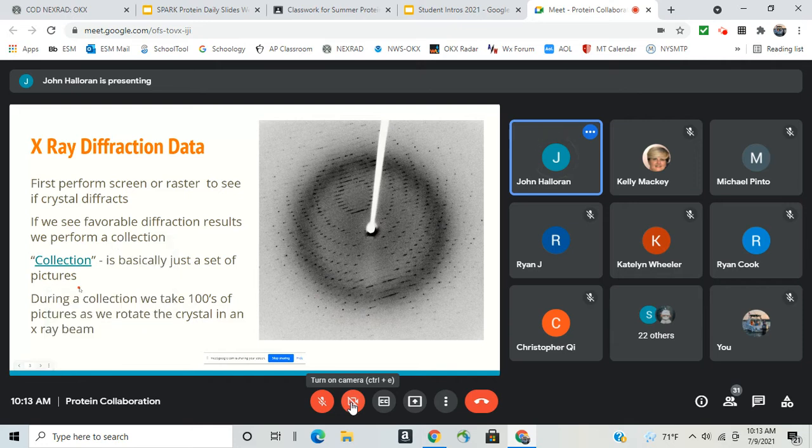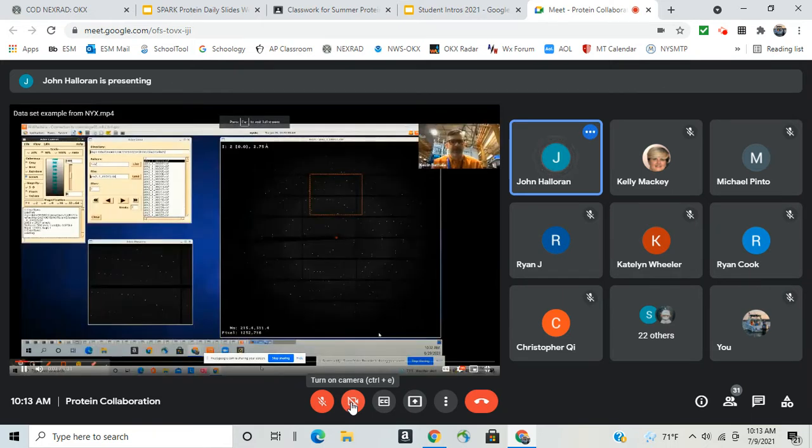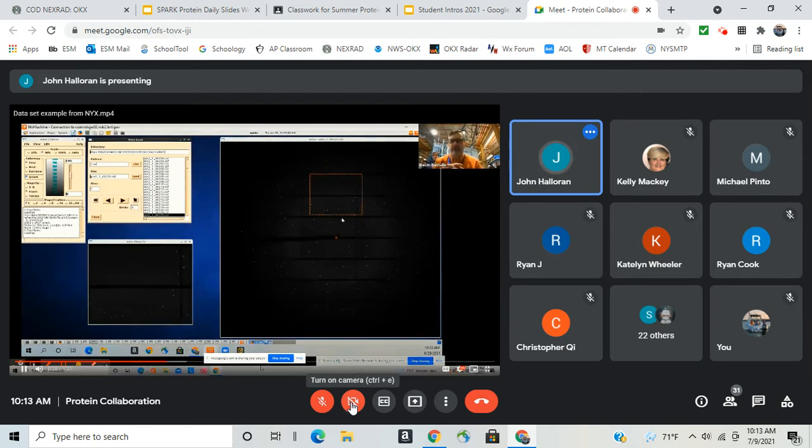Here's a quick video to give you an idea of what a collection looks like. This is at NYX after the collection. You can see all the images in the upper left — Kevin hits play and you can see all the diffraction dots moving as he scrolls through. It's almost like a flip-book. He probably has around 900 images of the same crystal shot from multiple angles, rotating 360 degrees with the machine set to shoot every third of a degree.